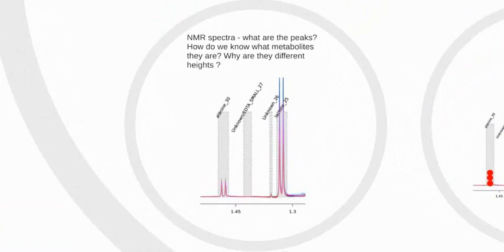Now here is an example of an NMR spectra. After running NMR spectroscopy on your samples or skittle bags, you may get an output like this. This is a small section of NMR spectra from a recent study, annotated using softwares and reference databases to determine what peaks correspond to what metabolites, where each peak reflects a hydrogen environment in the composition of specific metabolites, whereby some metabolites may have multiple peaks.